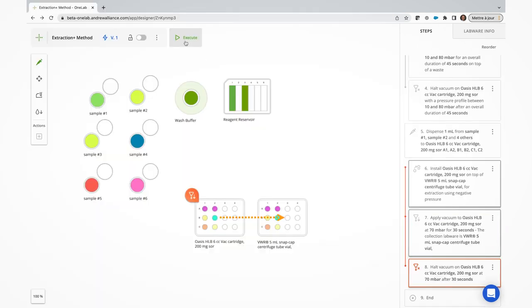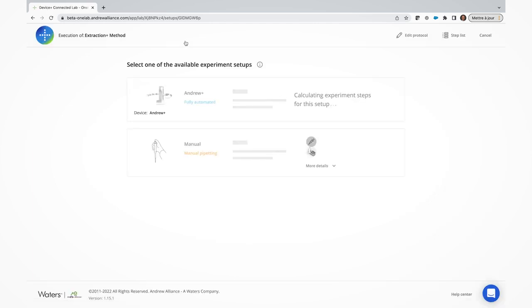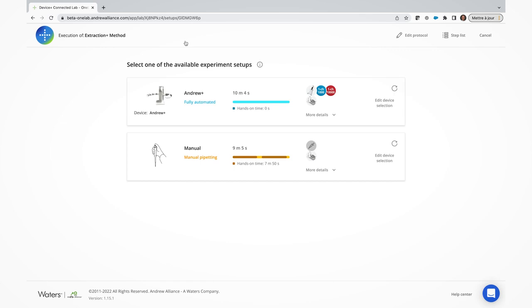Once your protocol is built, click on Execute and OneLab will calculate the best configuration for your method based on the available devices and pipettes, all whilst existing different execution options.